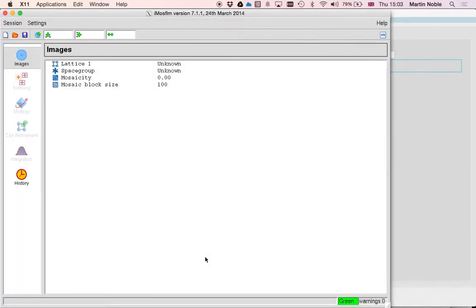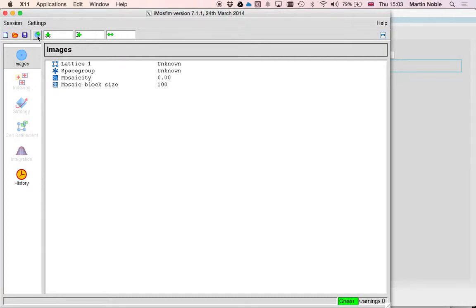It's going to fire up xwindows and then iMozFilm. How to run iMozFilm is very well documented. You can search on the web to find out more. I'll just run very quickly through autoindexing and processing so that we've got some output to have a look at downstream.